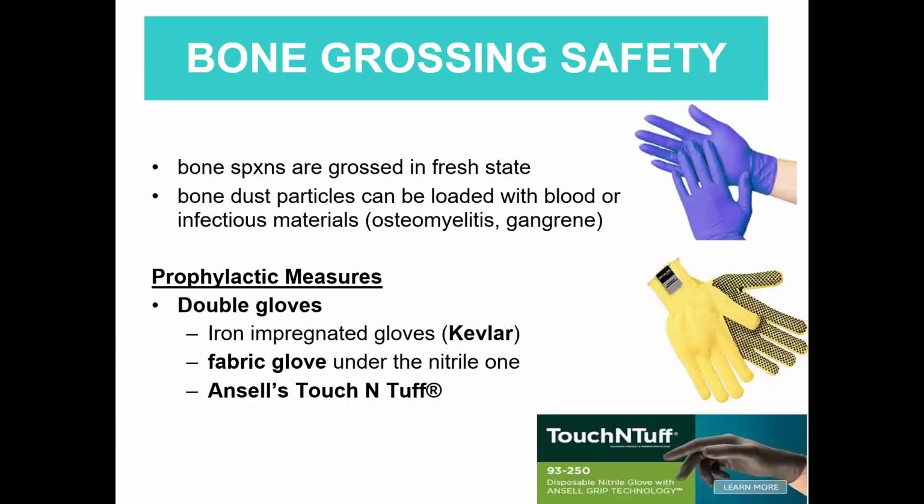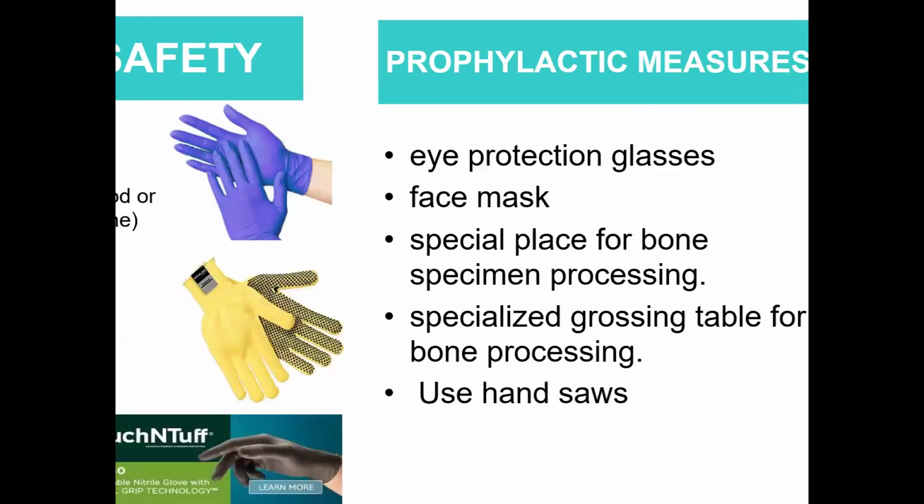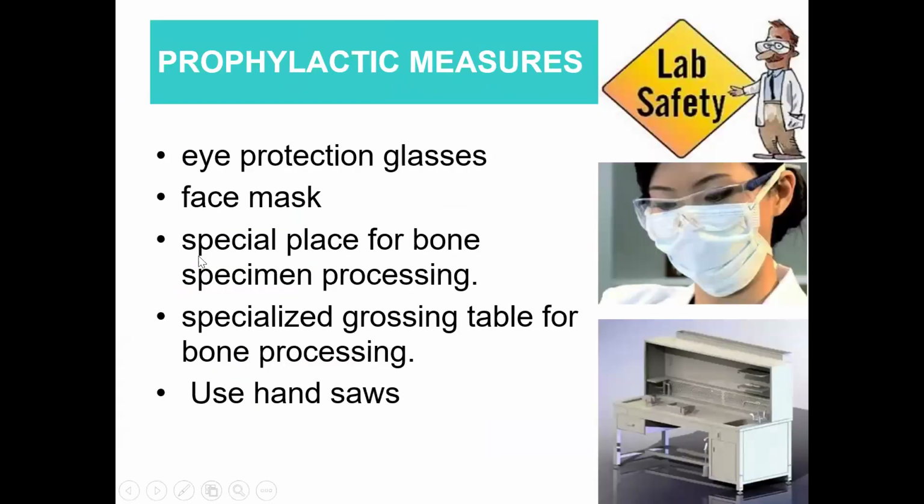Of course, it is important to wear your PPE, the proper personal protective equipment, in processing bones because they are also infectious. So, complete PPE should be worn.